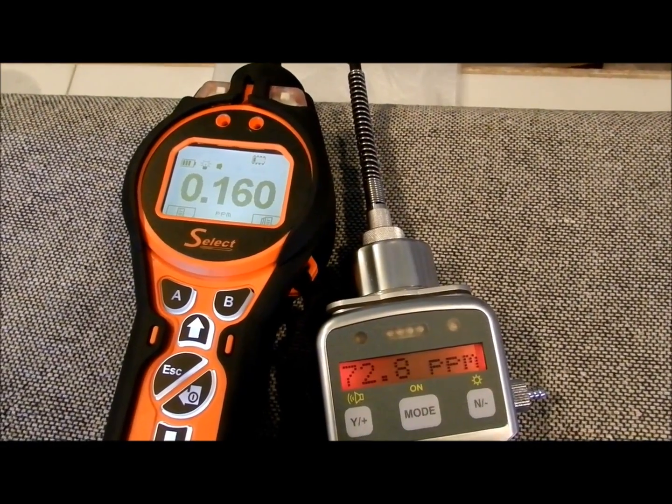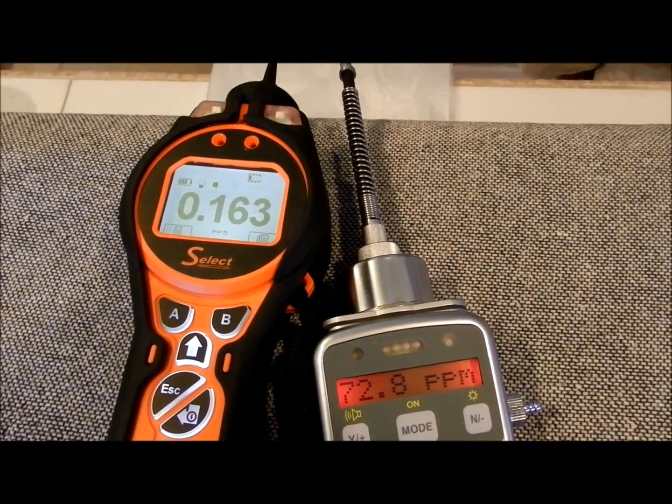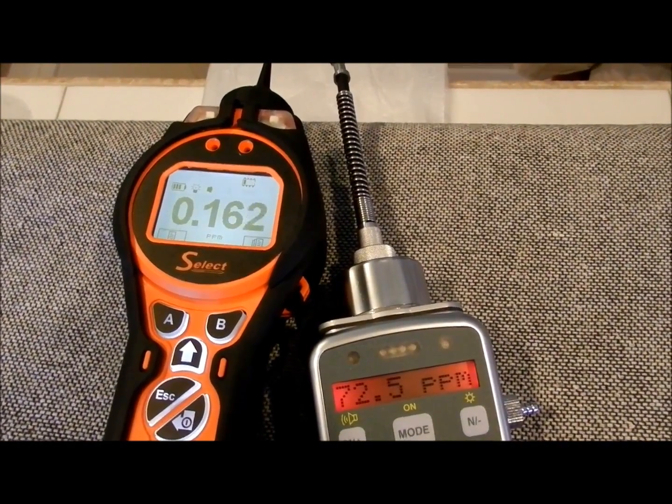You can see that on the right side, the Ultra Ray is still reading 72 parts per million, whereas the Tiger Select has hardly changed from about 160 parts per billion.